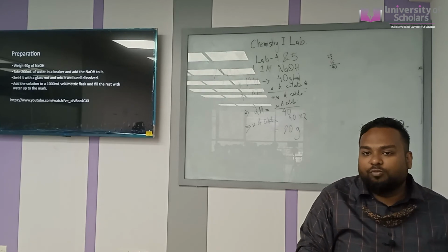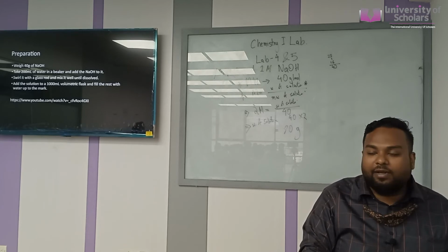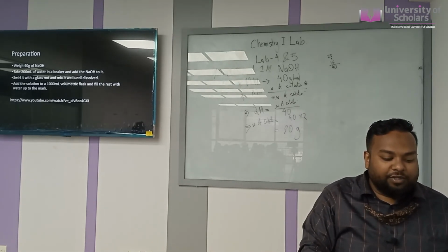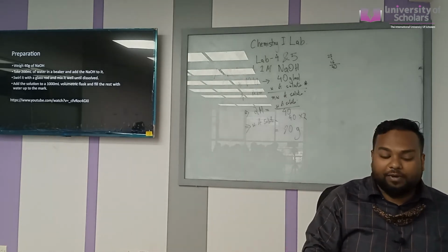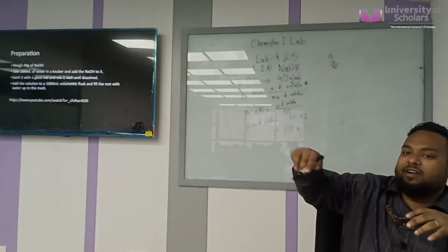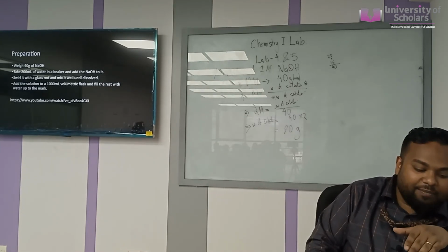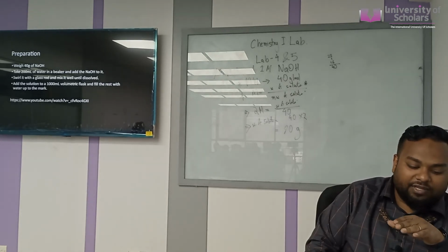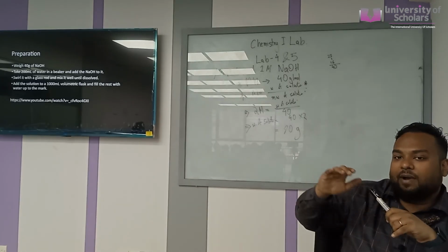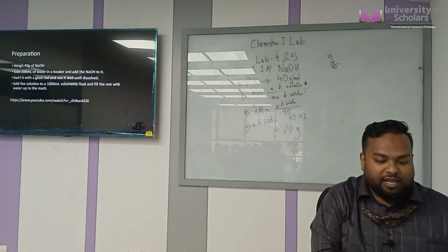আচ্ছা, সো যেটা আপনাদের করতে হবে, ইটস এ ভেরি সিম্পল একটা রিঅ্যাকশন। নাম্বার 1, আমাদের যেমন এখানে 2 মোলার বানাতে হলে 80 গ্রামস লাগছে, রাইট? সো সেক্ষেত্রে আপনাকে বলা হলে একটা 1000 ভলিউমেট্রিক ফ্লাস্ক নেবেন, সেটার মধ্যে আগে সোডিয়াম হাইড্রোক্সাইডটা ওয়ে করবেন, ওয়ে করার পরে 200 মিলিলিটার একটা বিকার নেবেন, বিকারের মধ্যে সোডিয়াম হাইড্রোক্সাইডগুলো দিয়ে অল্প কিছু পানি দিবেন, স্টেয়ার করে মিক্স করতে হবে, প্যালেটসগুলো মিক্স হতে সময় লাগে। যখন ডিজলভ হয়ে যাবে, তখন একটা 1000 মিলিলিটার ভলিউমেট্রিক ফ্লাস্কের মধ্যে ঢেলে দিবেন, ফ্লাস্কের যে মার্ক আছে, মার্ক পর্যন্ত ওয়াটার দিয়ে দিলেই ইয়োর প্রিপারেশন উইল বি ডান। একটা ছোট্ট ভিডিও আছে, দেখে নেন, অ্যান্ড দেন উই উইল বি গুড টু গো.